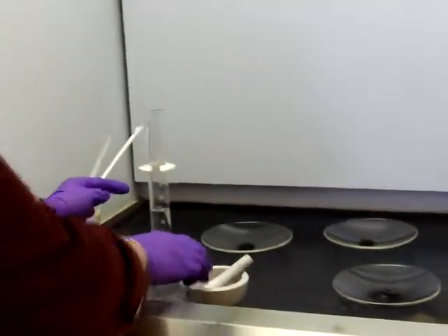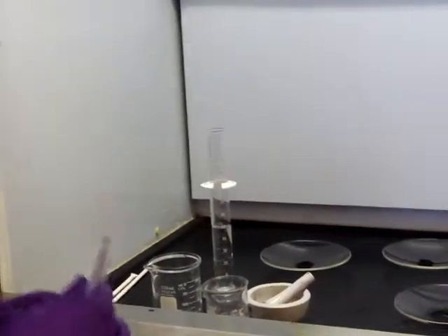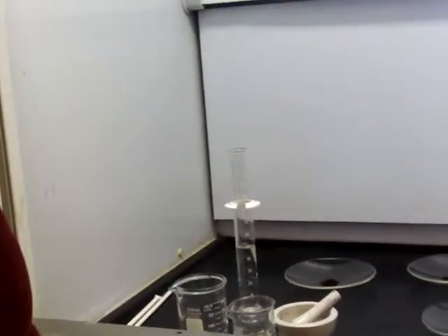My second one, I have a solution of concentrated sodium hydroxide, and I have hydrochloric acid. I'm going to combine them. What do you think will happen when I combine the two? Form a salt? Sodium hydroxide and hydrochloric acid, form a salt. Okay.